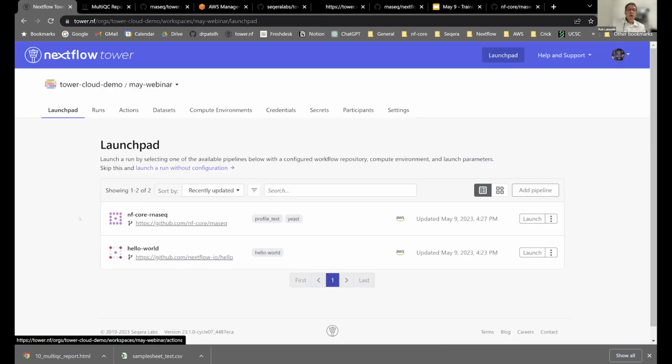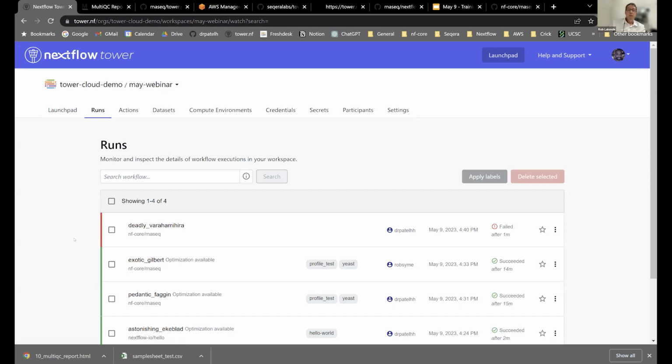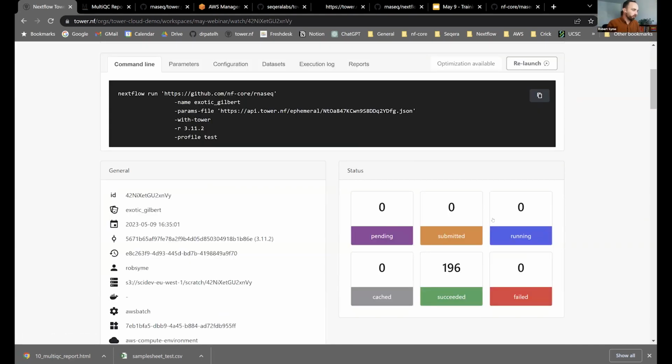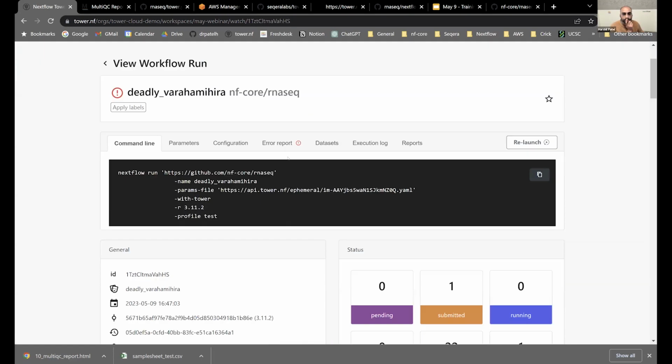Great. Next question, I think a quick one. Is it possible to resume a failed pipeline from another team member? Yes. Good question. The answer is yes. Presumably, if you're in the same workspace, you should be able to. I don't know why this one failed.